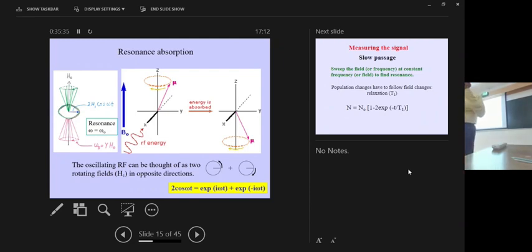17.6 Tesla. Each Tesla is 10 kilogauss, so that many kilogauss of magnetic field is there. And how much is this? This is Gauss. This amplitude 2h1 cosine omega t is the oscillating RF frequency. This is the radio frequency electromagnetic radiation. You have the magnetic component of that, 2h1 cosine omega t, and that h1 is the amplitude of that. How much is that amplitude? It is Gauss, sometimes milligauss.